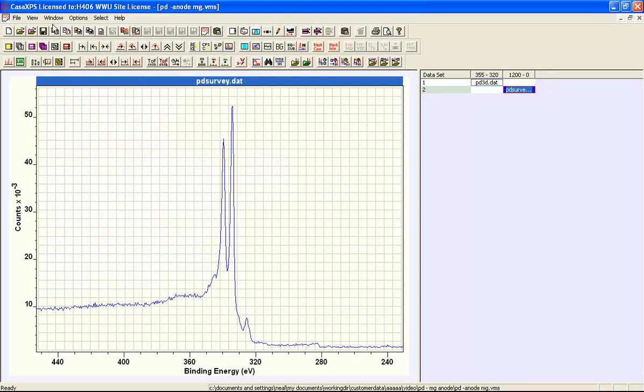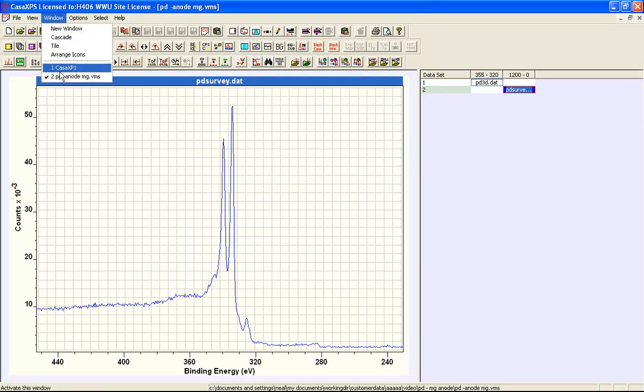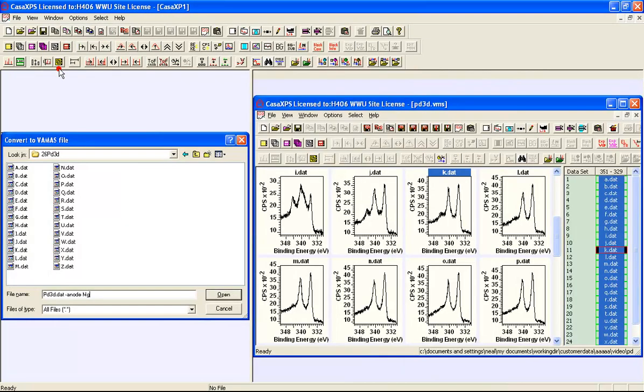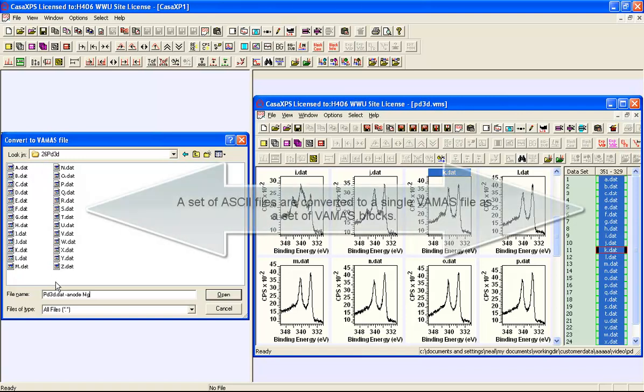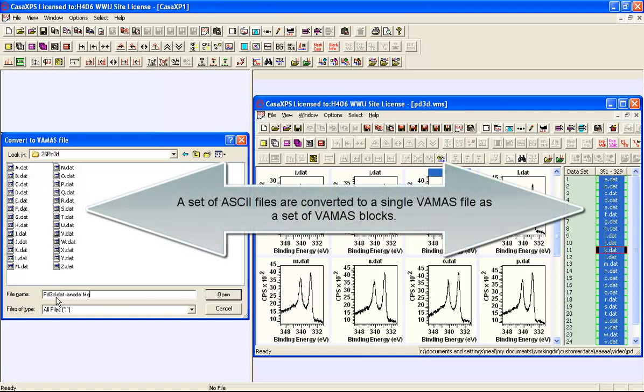Data files converted by the DAT filter make use of a set of files that are all located in the same directory with the file extension dot DAT. These files are read and converted to a VAMAS file.